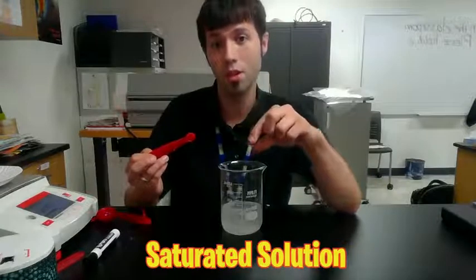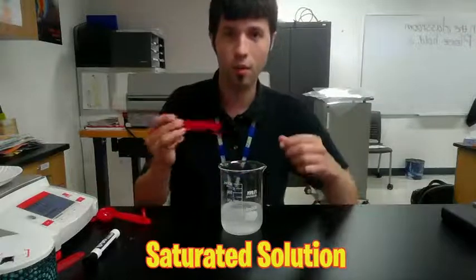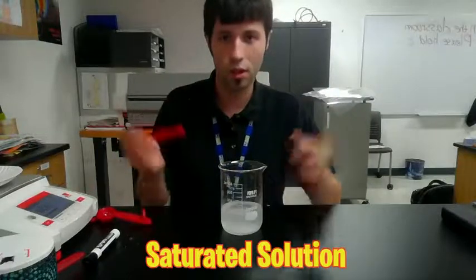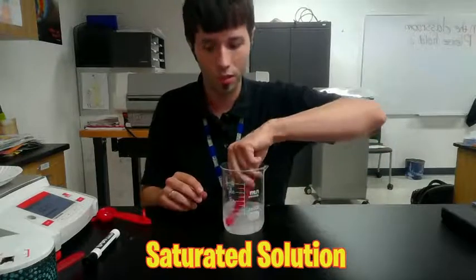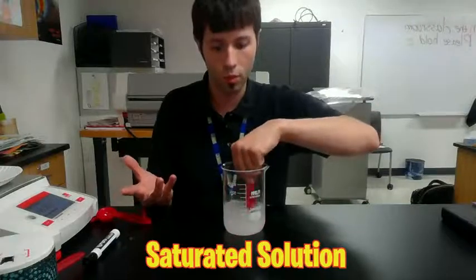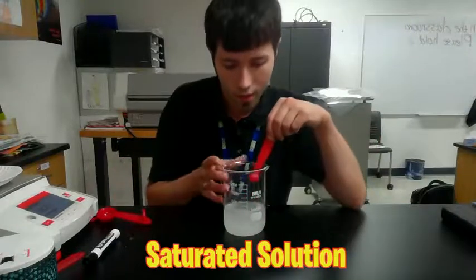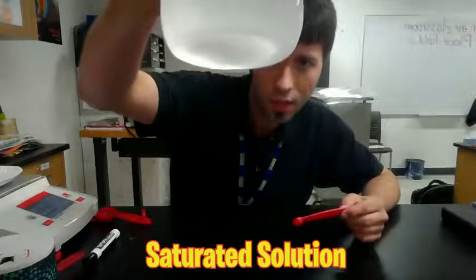If you remember that simulation I showed you of those water molecules attaching themselves to the salt molecules, well now, basically, all the water molecules are holding on to salt molecules. There's no more water to hold on to any more salt. So water can only take on so much solute before it runs out and it can't dissolve anymore. And there's like a big pool or a big chunk of salt gathered at the bottom of the beaker here.